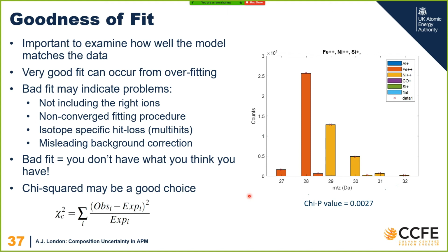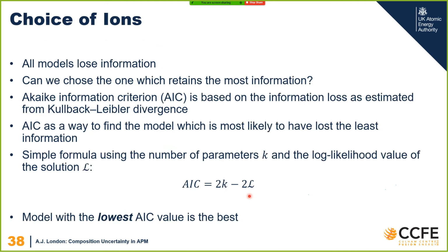So whatever kind of composition measurement you're doing, always check that your peaks match what you think you have, because if they don't match, you don't have what you think you have, and then your composition's wrong.